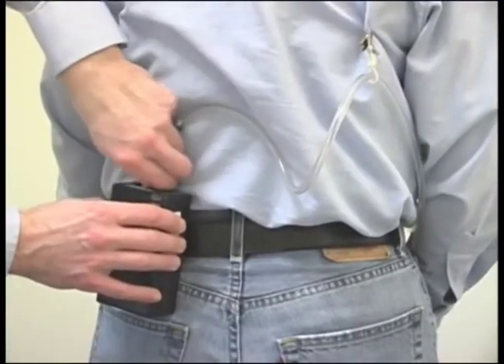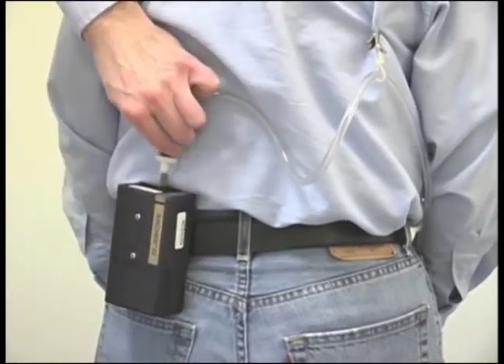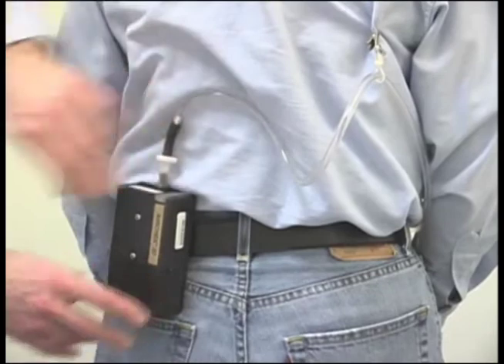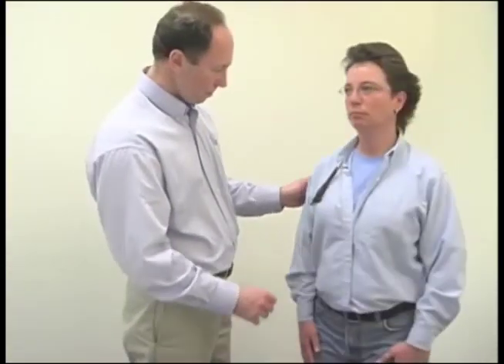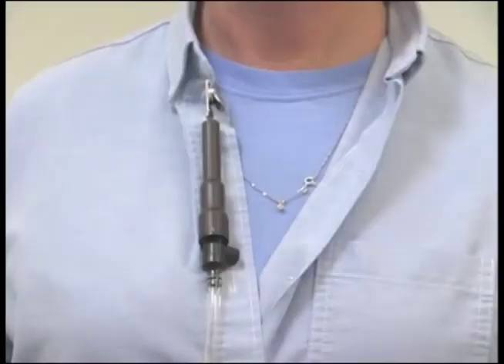Check to ensure the hose connection is screwed tightly to eliminate leaks. It is a good idea to check the pump throughout the workday to make sure it is still operating at the flow rate you set. Ensure that the sampler is still assembled properly and that the hose has not become pinched or detached from the media or the pump.